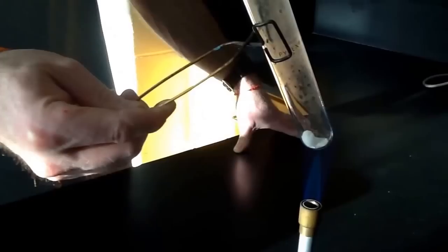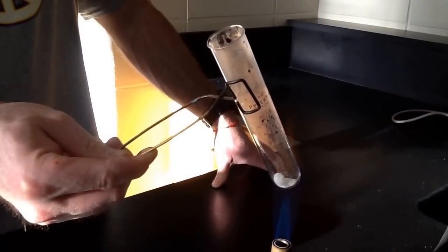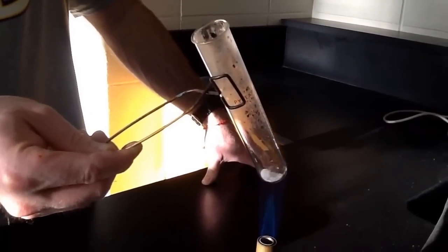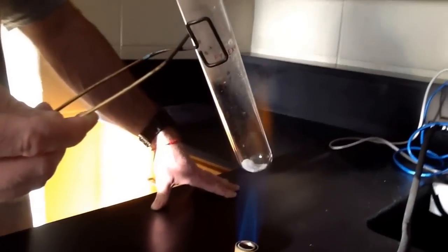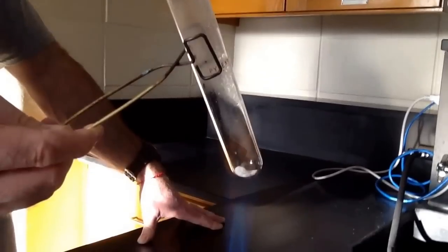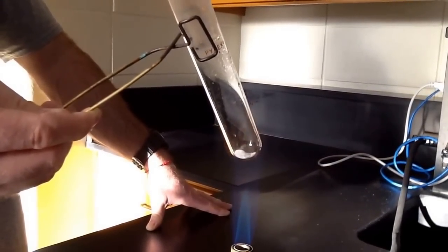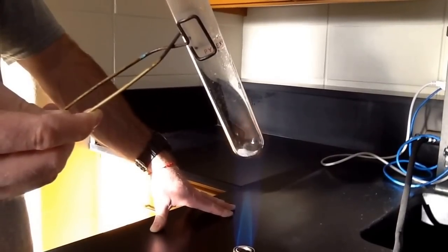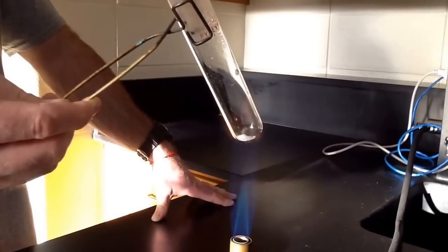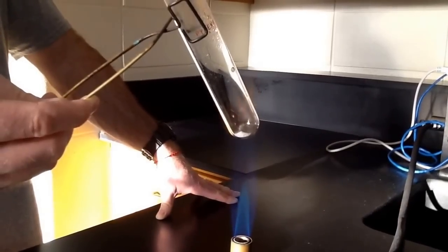And so as we heat this up, what we're noticing is that our ammonium carbonate, our reactant, is decomposing. You'll notice in the neck of the test tube, you'll see some gas forming there. We definitely have that going. And in just a few seconds here, I believe all of our reactant is going to disappear. All right, it's going to turn into, I think, 3 different gases: ammonia gas, water vapor, and carbon dioxide.